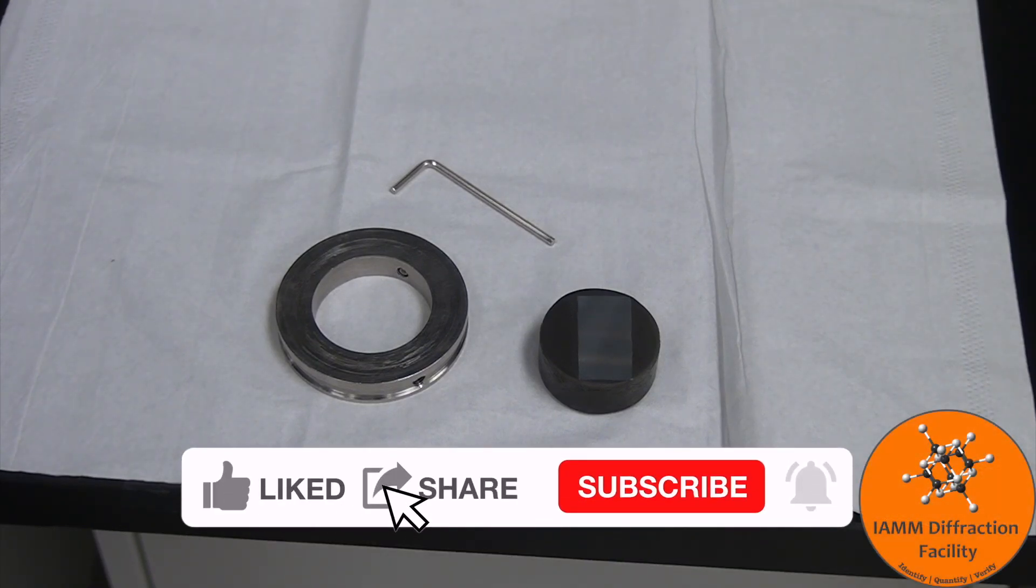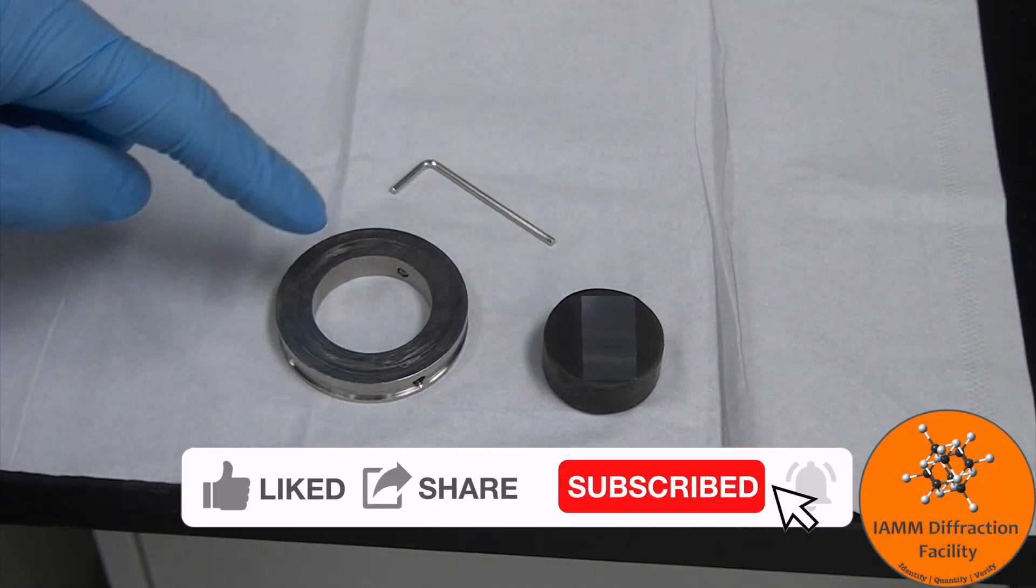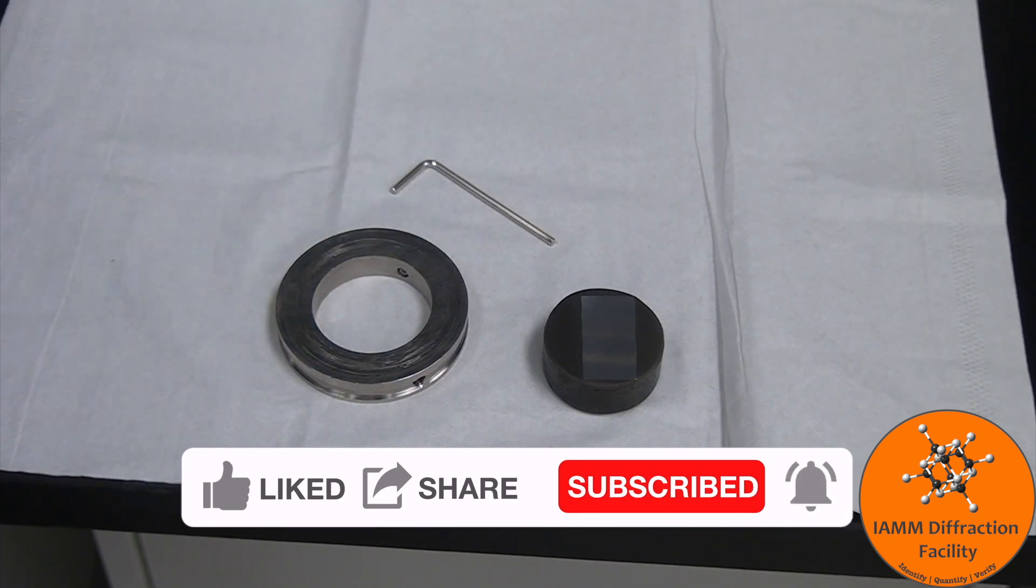In order to use a mounted sample, we just need your sample, the sample holder, and a small allen key.